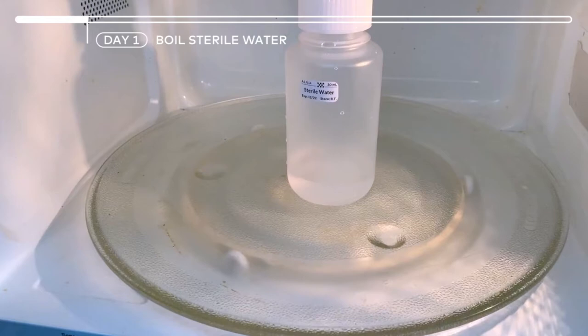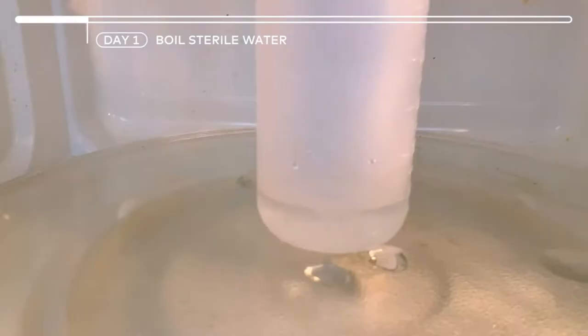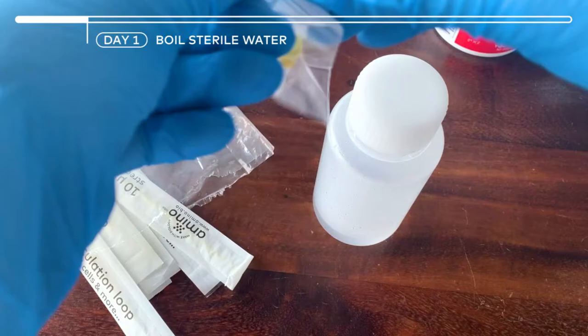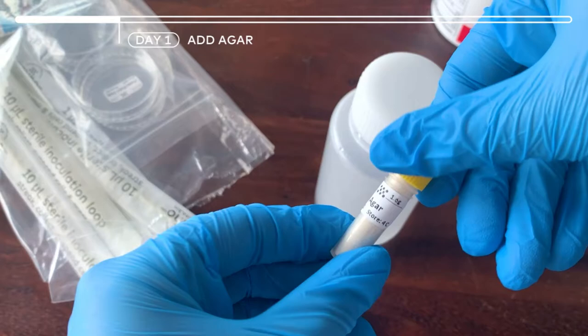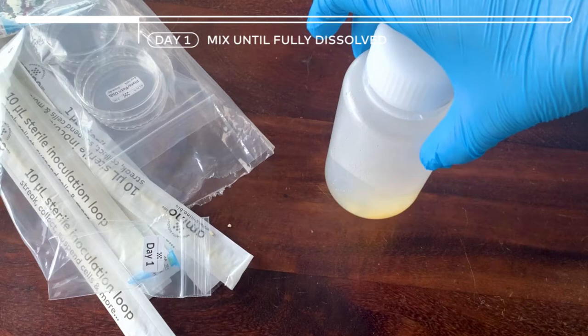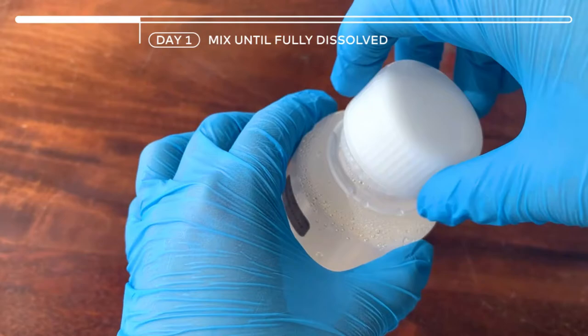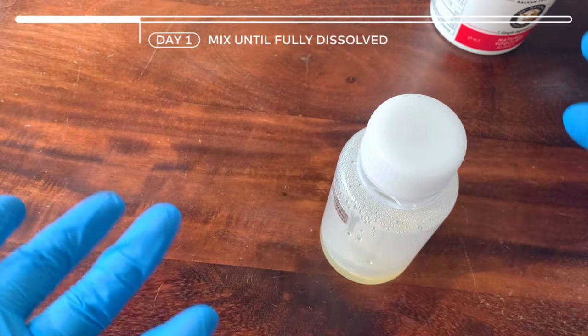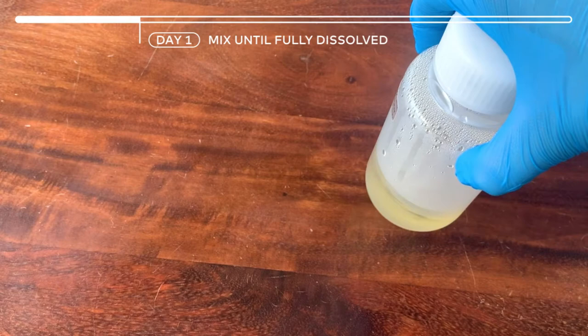So the first thing will be to boil the sterile water to prepare our agar. Put the sterile water in the microwave for 45-50 seconds and you will know when it's ready when you have bubbles showing up. Be careful when handling it because it's super hot, and as soon as you get the water, take out your agar packet. Close it in the activation bag, loosely close it up and gently mix until it's fully dissolved. Keep mixing until it's very clear with a yellow tint, and if you still see some particles moving around, you can put it in the microwave for not more than 4 seconds, warming it up in intervals until it fully dissolves.